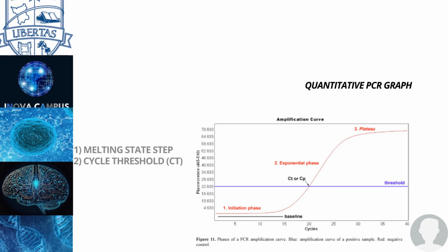Eventually, your concentration will reach a plateau, will reach a peak, and will fade away, because as you go on and you do lots and lots of cycles, it stops growing at an exponential rate.